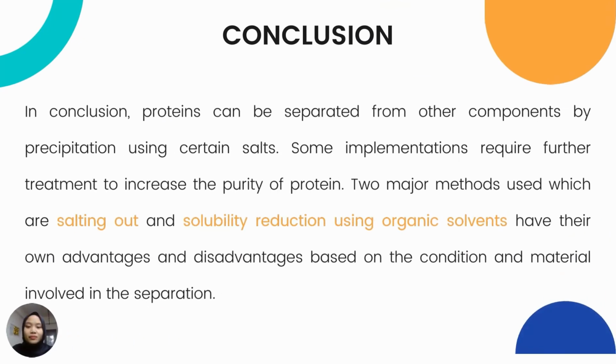In conclusion, proteins can be separated from other components by precipitation using certain salts. Some implementations require further treatment to increase the purity of protein. Two major methods used have their own advantages and disadvantages based on the condition and material involved in the separation.